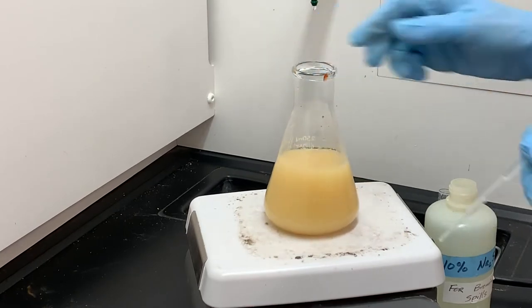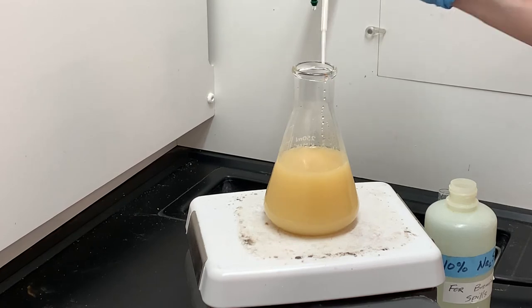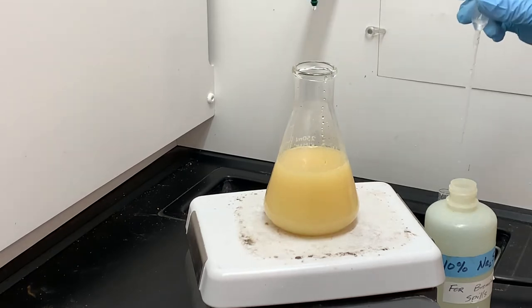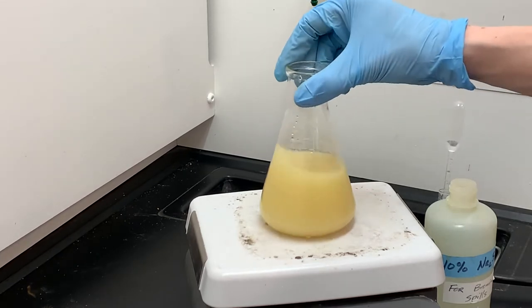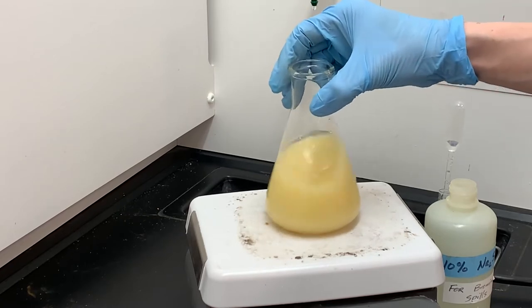The solution is still kind of orange-ish, but it's pretty close to yellow. I feel like there, that looks really good, looks perfect. So we'll let this finish stirring to finish off that last little bit of reaction time.